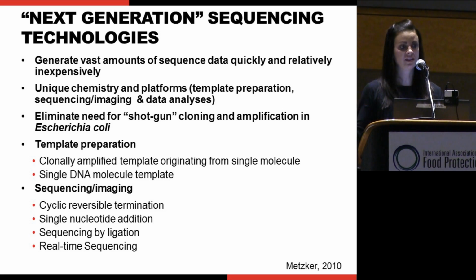In terms of the actual sequencing and imaging, you either have reversible termination, that's the Illumina technology, adding single nucleotides at a time as a substrate, sequencing by ligation, that would be the SOLiD technology, and then also real-time sequencing, so that would be PacBio or Helicos.